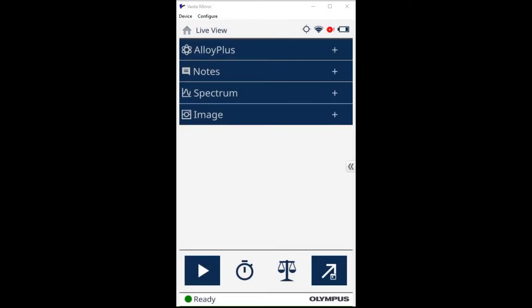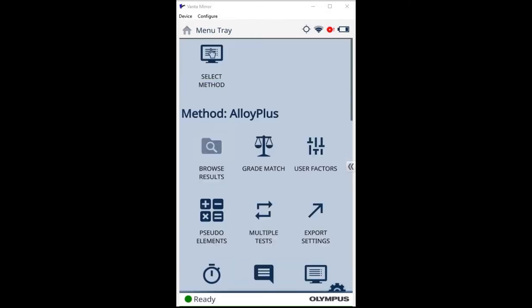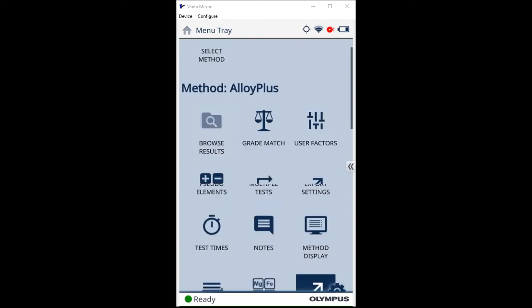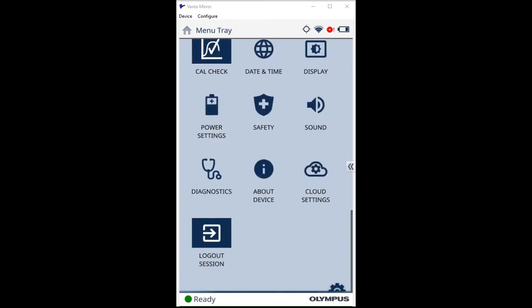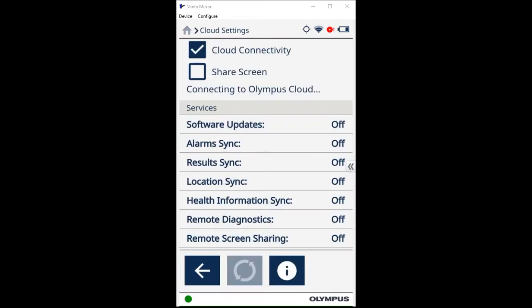On your Vanta, pull down the menu tray from the upper right corner of the screen. Select Cloud Settings and select the Cloud Connectivity and Share Screen options.